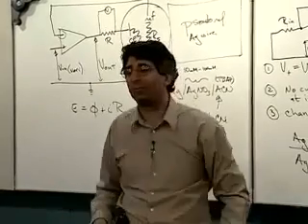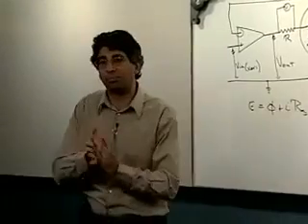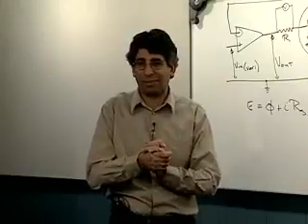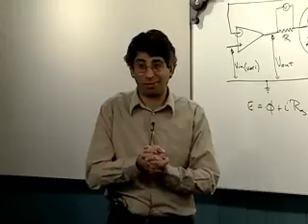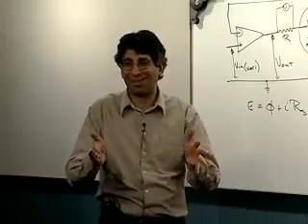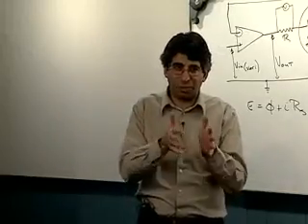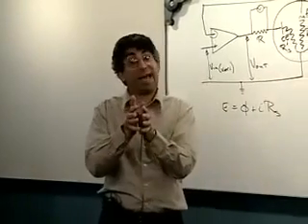Talk about short time. What time scale? A couple of seconds you're good for. Enough time to do a cyclic voltammogram at a reasonable rate, for example, but not over, well, even a minute would be pushing it. Let's call a minute the outside that you want. And it's also going to depend what kind of mass transport you might have going through your cell, because you're really depending on the area right around this wire being very stagnant.